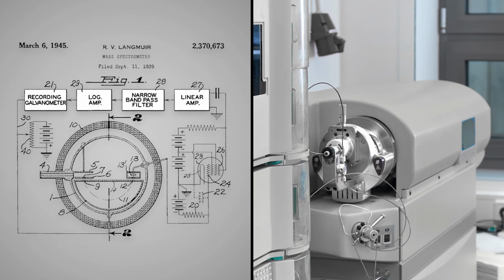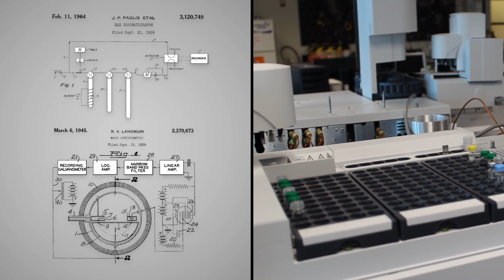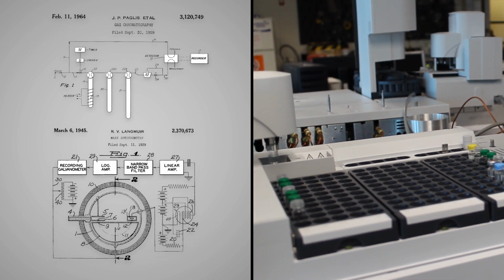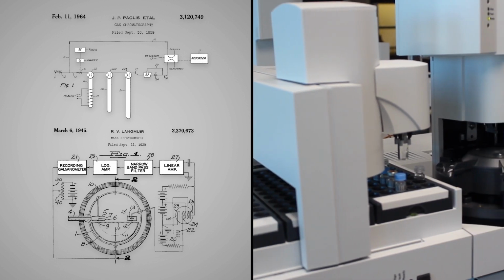Scientists are closing that gap though, and that's what led us to Gavin Sachs and Jessica Rafson at Cornell University, who are working on a speedier approach to volatile analysis. They're using mass spectrometry, which is a very useful tool for measuring volatile odor molecules. As of now, the bar for this type of mass spec work is set by gas chromatography mass spectrometry, or GCMS, but it's time consuming.